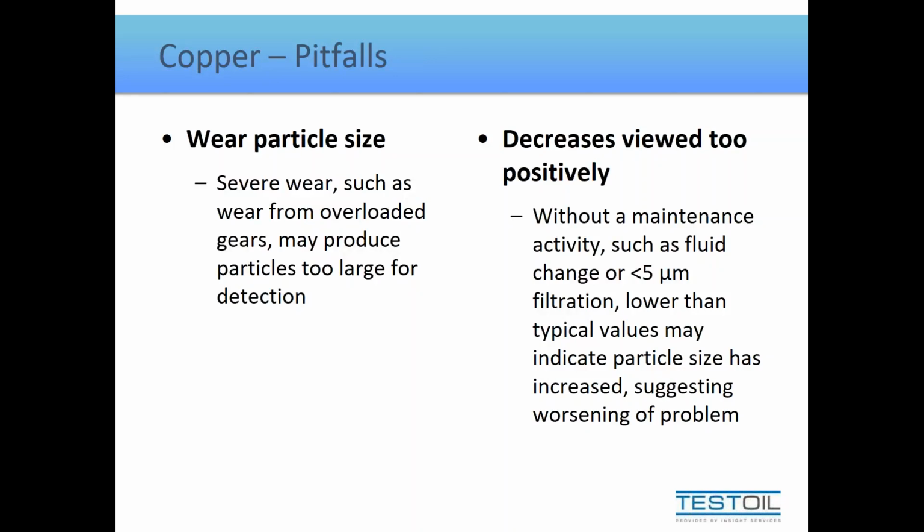Any supposition centered around filtration, though, must understand that, again, this test is accurately measuring particles in that 0 to 5 micron range. So unless we're filtering down to less than 5 microns, filtration will have next to no effect on the levels that we're measuring. So don't always assume that, well, the filters must have removed it, because not a lot of people use less than 5 micron filters in most operating systems under full flow conditions.